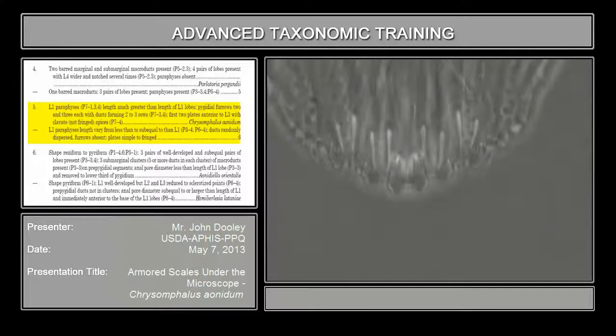But when you see something like this, you're going to run into the related genera, and then there are some other genera where these types of structures go all the way up the pygidium — quite a ways up — but then they usually decrease in size as they go farther anterior, toward the end of the pygidium. But this is very, very important where they're really elongated. The rule of thumb is that if you take the longest one and it's much longer than the length of the medium lobe — it has to be the medium lobe, not the second lobe — then it's going to be this group. There are others that have elongated second lobes.